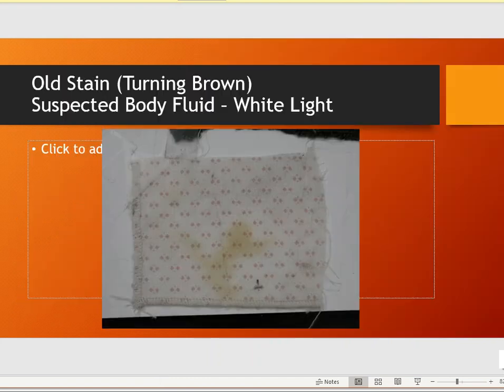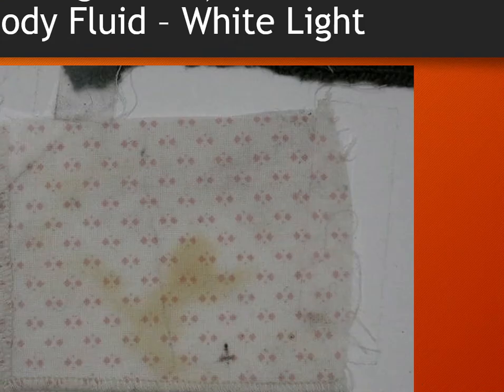So what does this thing look like? All right, so here is basically a piece of fabric, and I can visually see a stain with my eyes, right? So hold on. Let me just make this a little bit bigger maybe for you. So this is basically white light, okay? This is me not shining anything at all onto that piece of fabric. This is all that it is, and I physically see a stain here, right?